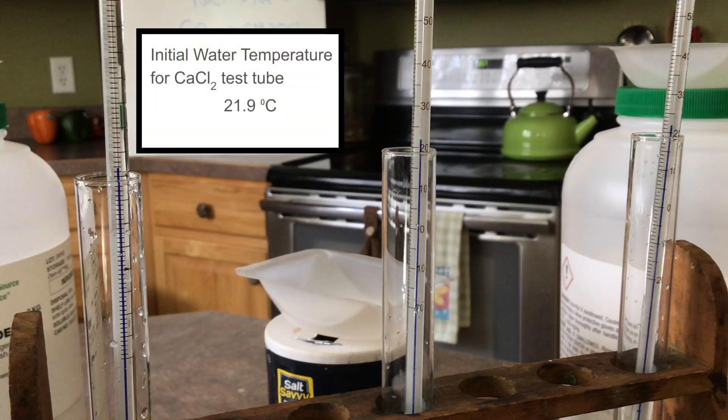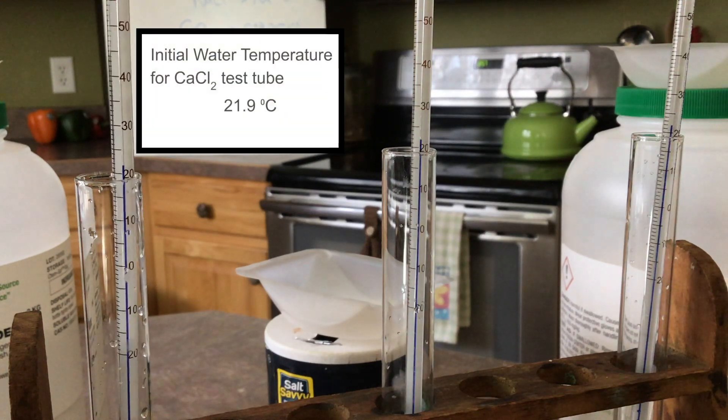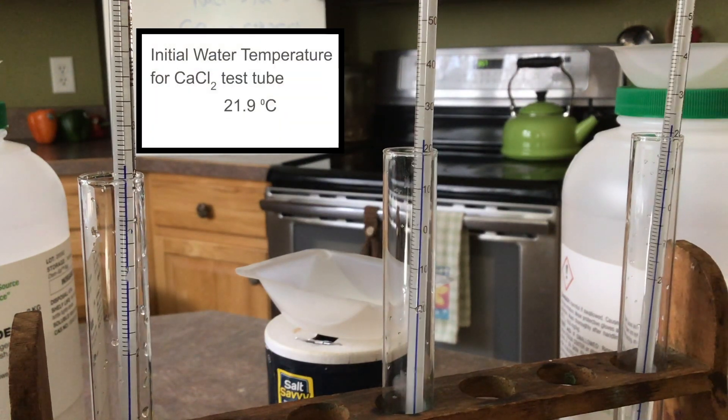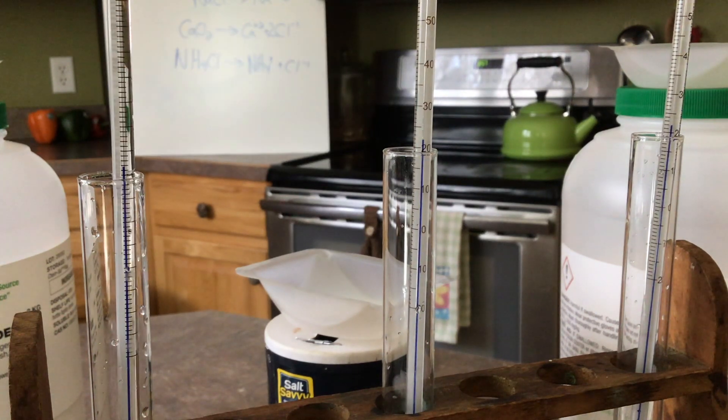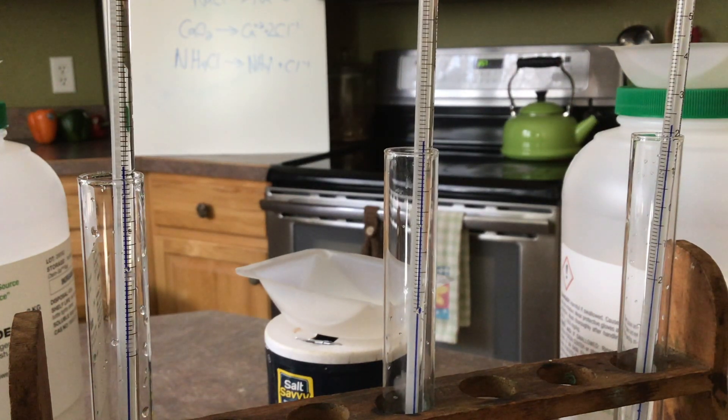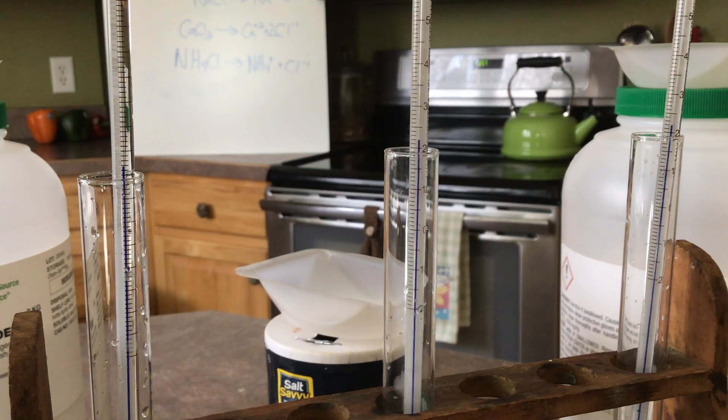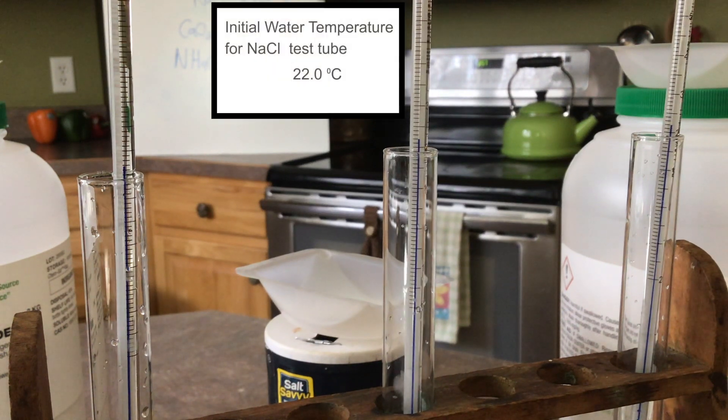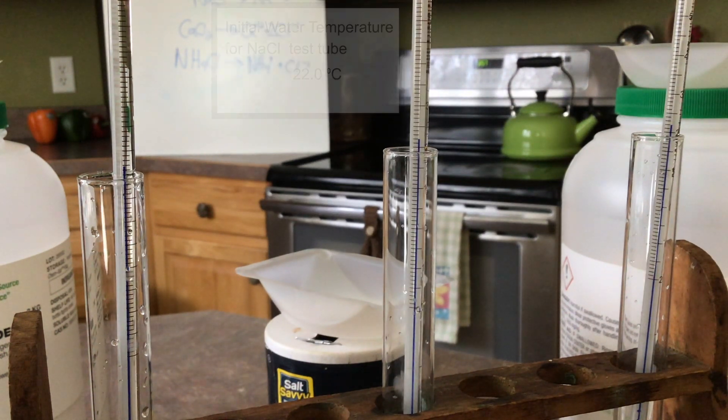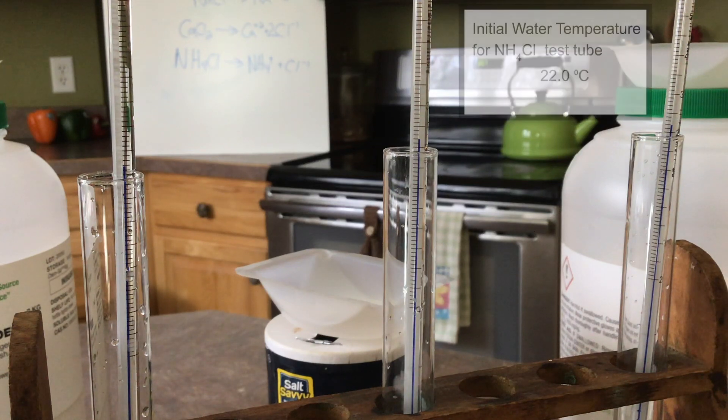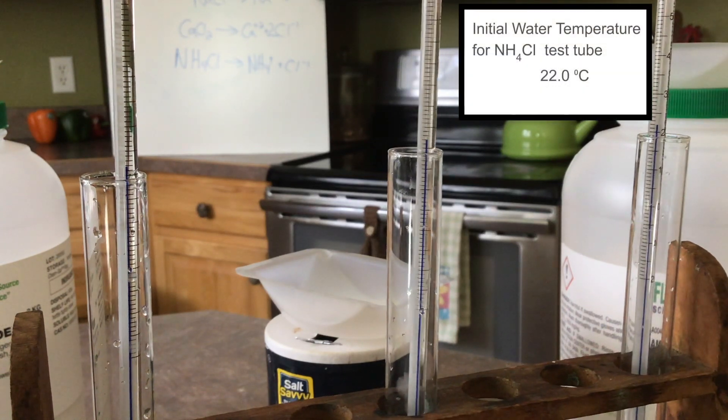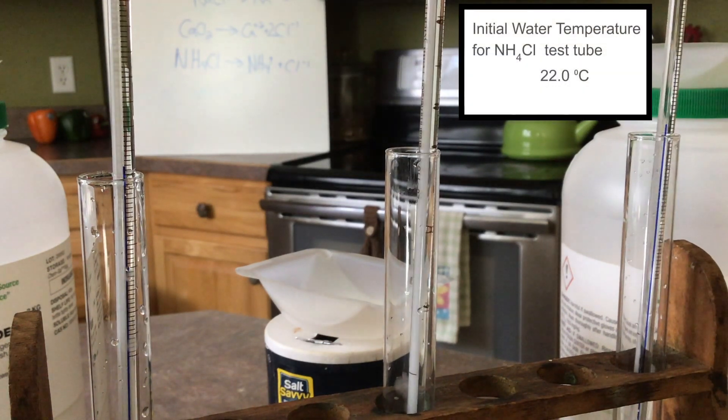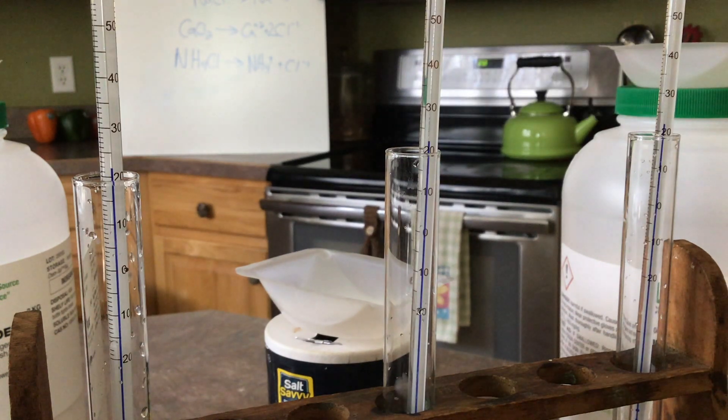As you can see on the left, our calcium chloride temperature is at about 21.9 degrees. Our sodium chloride test tube is at about 22.0 degrees Celsius. And the test tube that we will eventually put the ammonium chloride in is at about 22.0. Now let's go ahead and add the salts and see what happens.